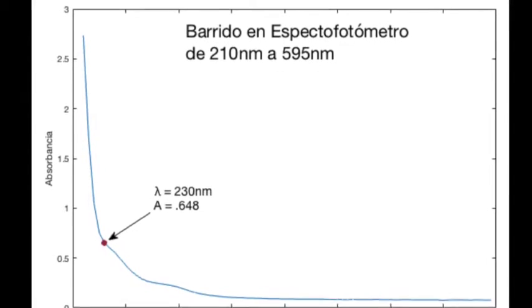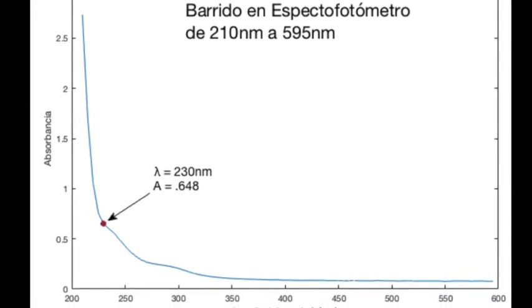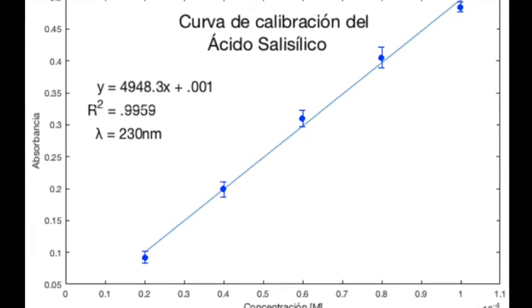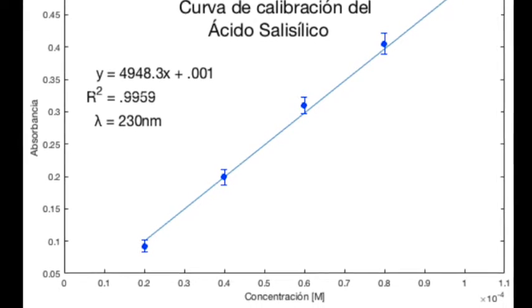dialysis method. In our project, we first found the correct wavelength where salicylic acid concentration should be measured in physiological conditions with a phosphate buffer. We also constructed a calibration curve using 5 different dilutions with set conditions that will help us measure the changing concentration with time in our equilibrium dialysis with a linear equation.